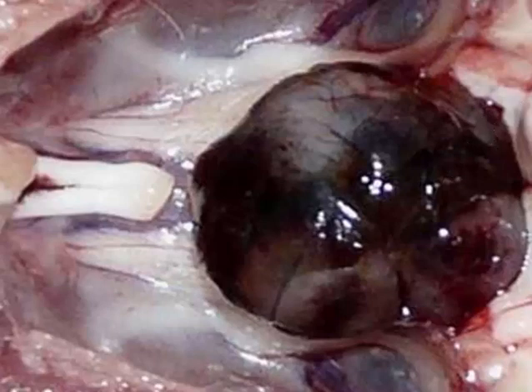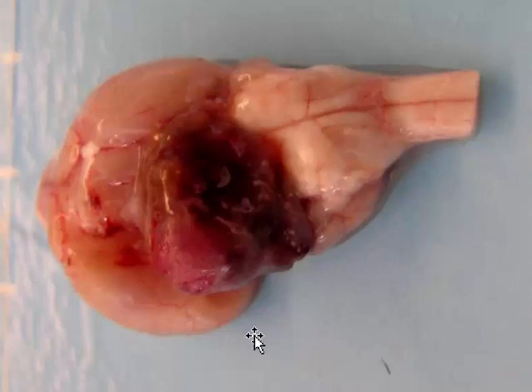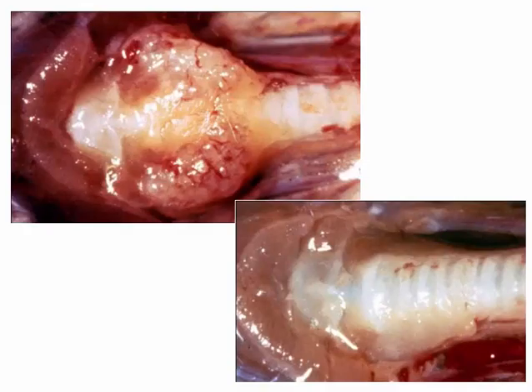Pituitary tumors are generally low incidence, seen in up to 10% of B6 mice and very low in Swiss mice. You can see them in female mice, especially obese females fed estrogen or progesterone compounds. Here's another one that seems to be invading the bottom of the brain — I'm going to go with pituitary carcinoma in this particular case. And this one is a thyroid carcinoma model — a RET/PTC1 transgenic mouse, which is a good model for thyroid papillary carcinoma.